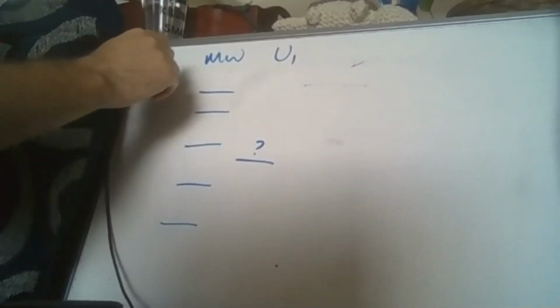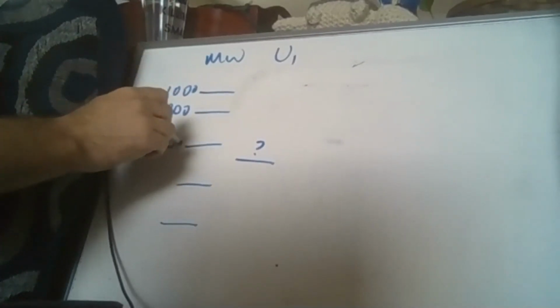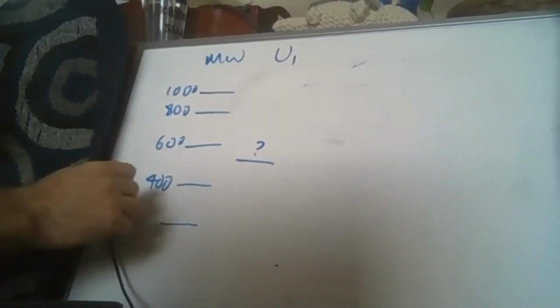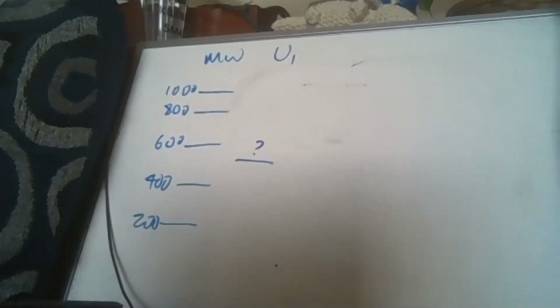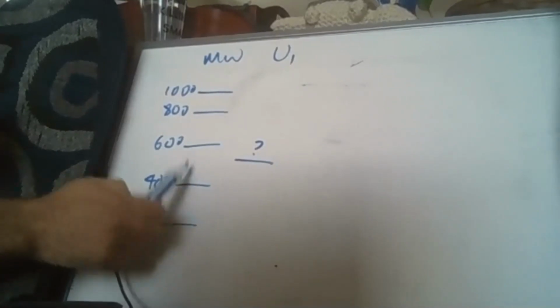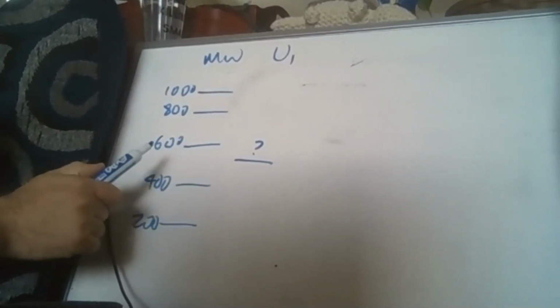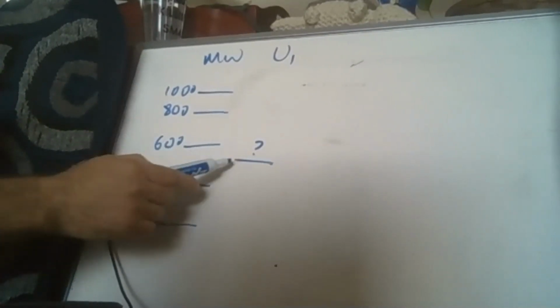Let's say this is something like that, right? So you know that your unknown is somewhere between 400 and 500, or 600, sorry, but you don't actually know the exact value, right? Because it's an intermediate.